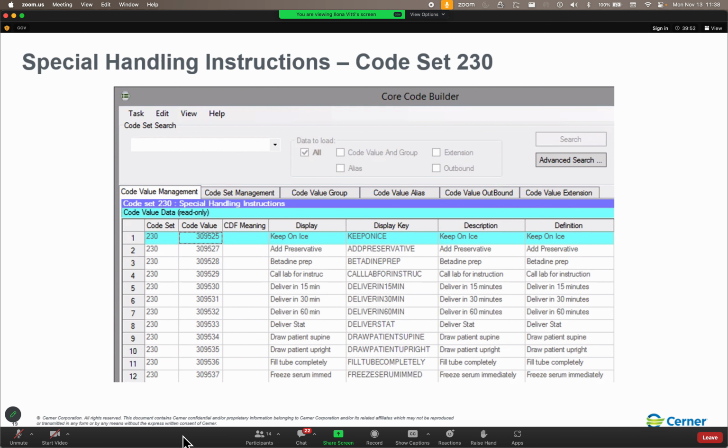are we going to say that we are assuming this is? So let's say the site prefix and the year are truncated off of the accession number. Well, the system is going to assume current year. But let's say even more, part or all of the Julian formatted accession number, the site prefix, the year, and the Julian date are truncated off, and all we're left with is that 4 to 6 characters at the end.